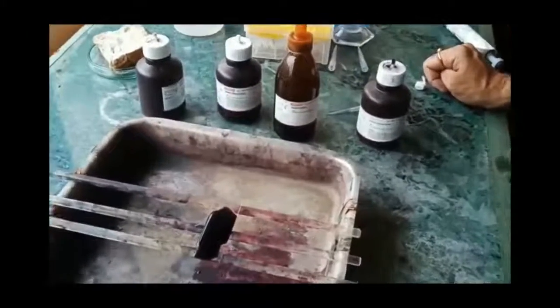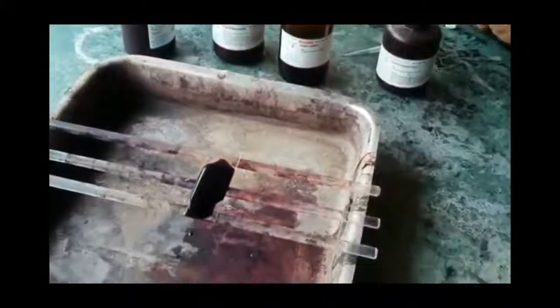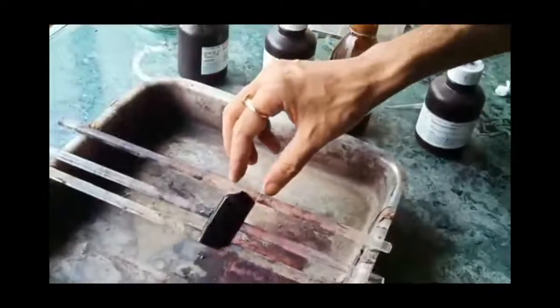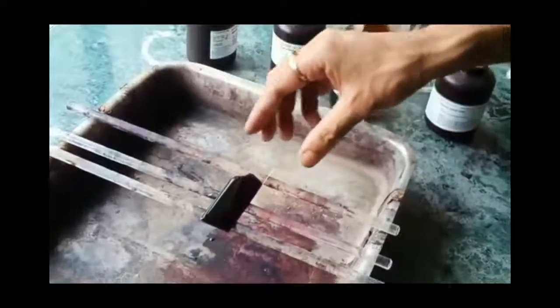We'll have to keep a proper check on the time. As the 30 seconds gets over, we need to gently rinse off the stain with water. Wash it away with water, keeping in mind that the smear is not washed off.